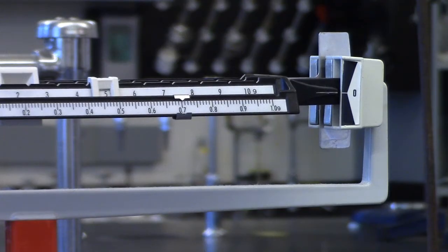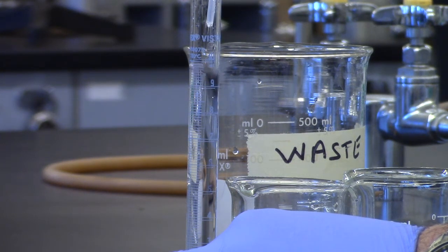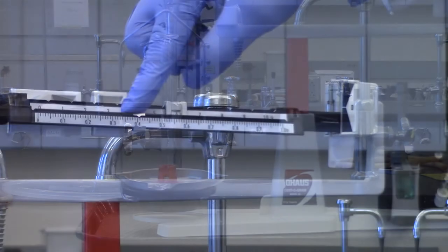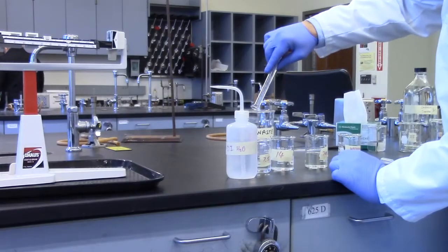Record the mass. Fill the 10 mL graduated cylinder with distilled water — a disposable pipette may be helpful to reach the 10 mL mark as close as possible. Once filled, weigh and record the mass of the 10 mL of water plus the graduated cylinder. Empty into the waste beaker.